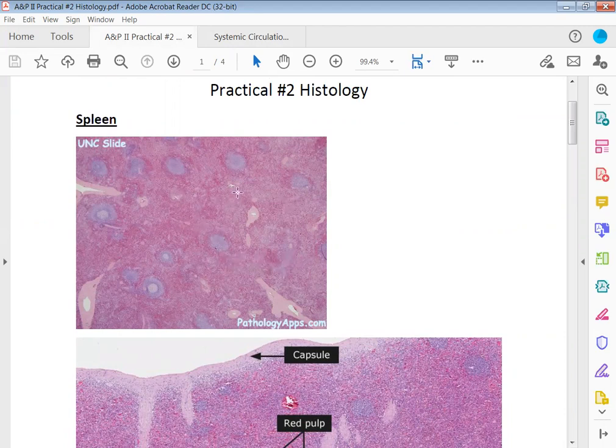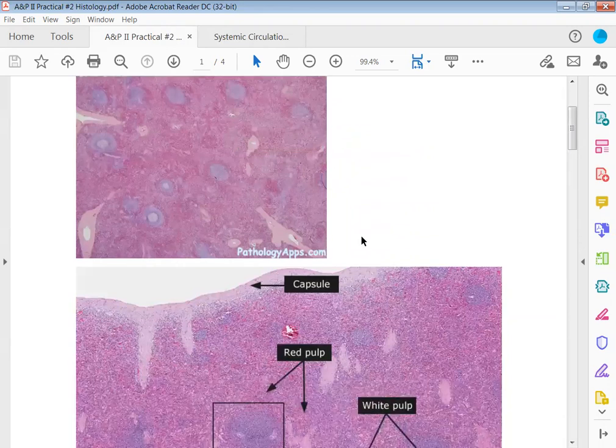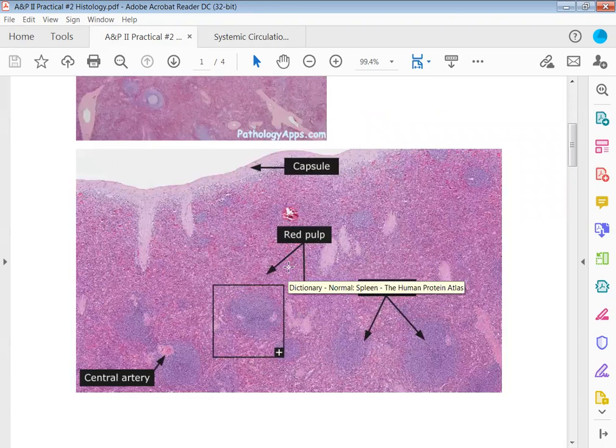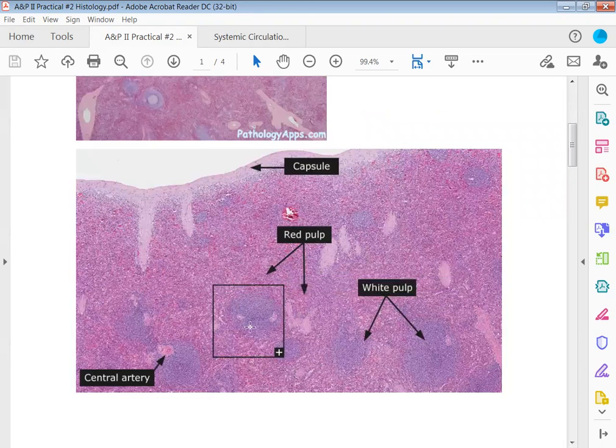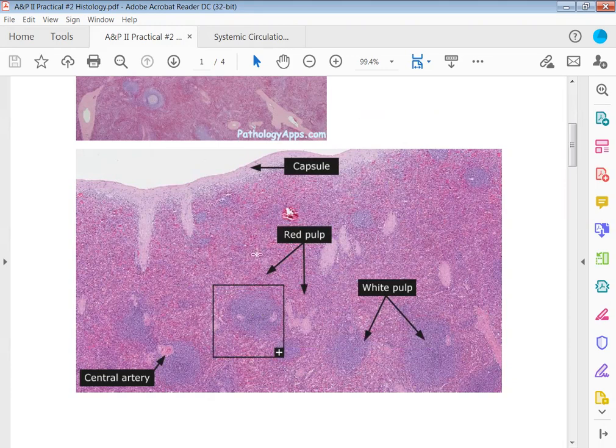Going to this second image here, we've blown this up so you can see much more detail. These circular areas where it's much more condensed and a little bit darker color, this is going to be your white pulp. And then your red pulp is out here, it's lighter and less compact.